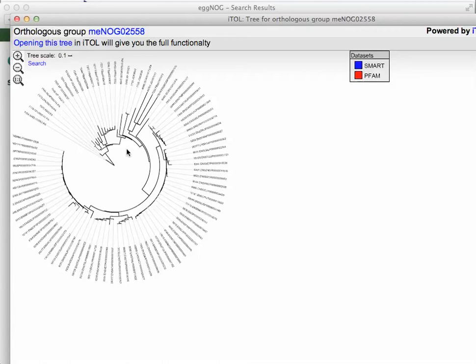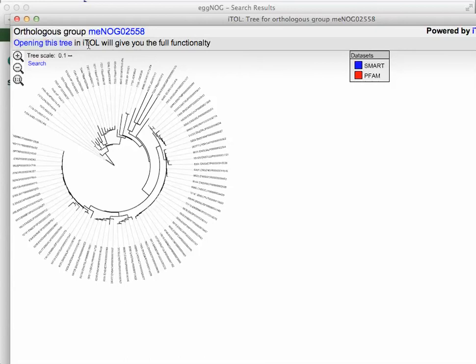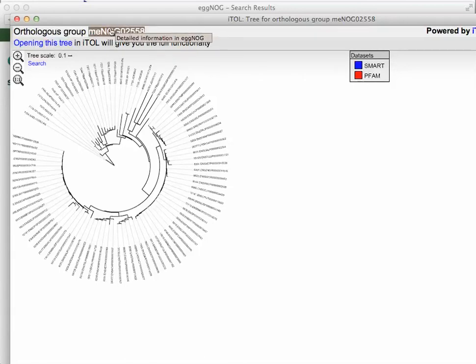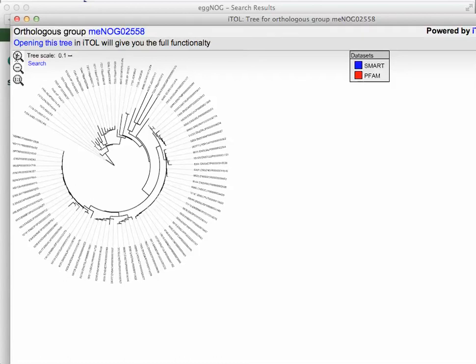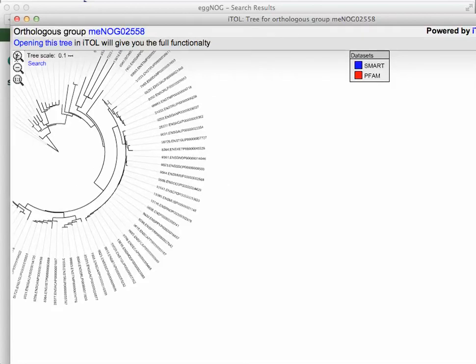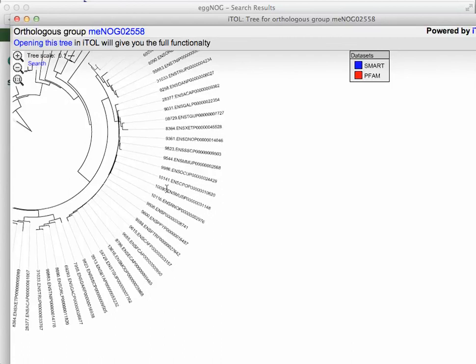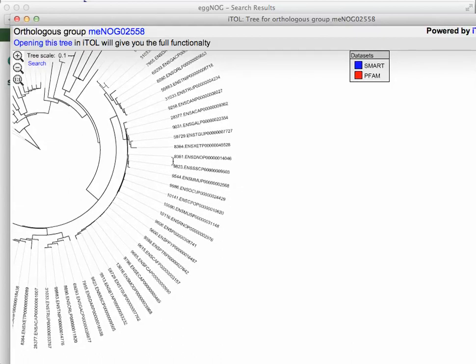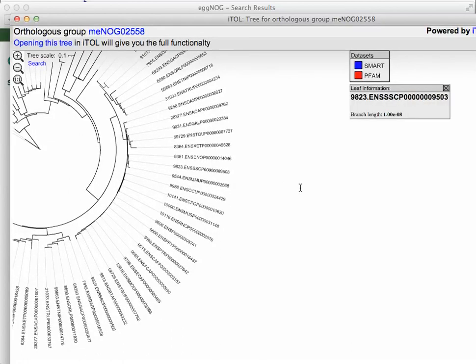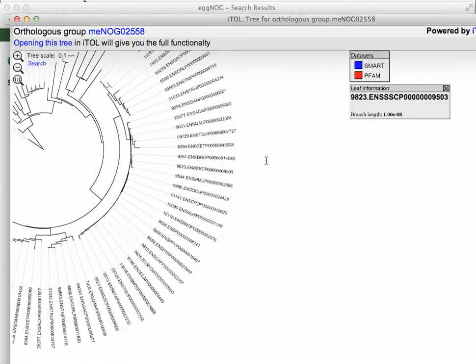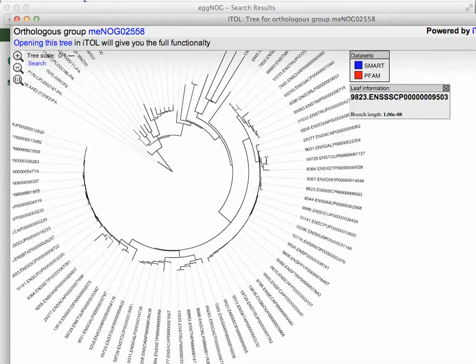Now, basically, it's giving you the tree. You can go to the full functionality by opening iTOL up here. But we're not going to open the tree. We're just going to look at it. You can look at more detailed information about this in eggNOG. Let's expand the tree a little bit, just to give an idea of some of the information we have. Pull it over. There we go.